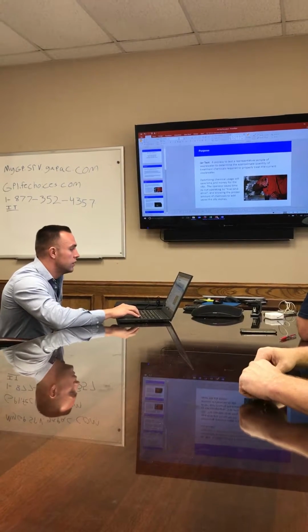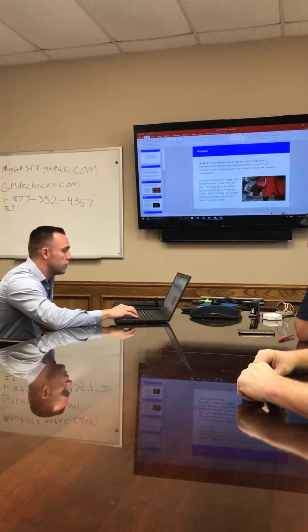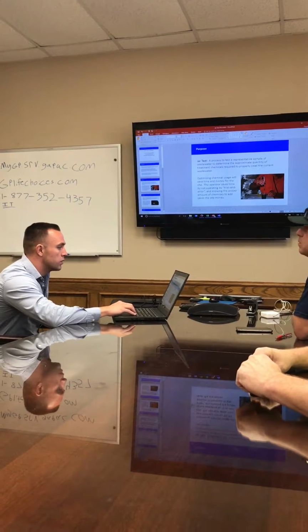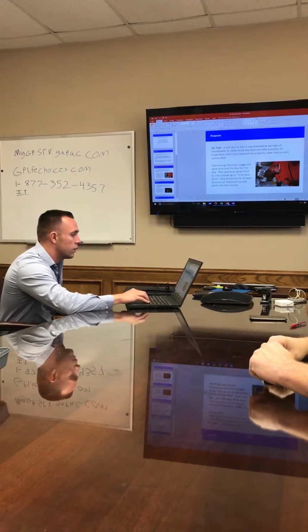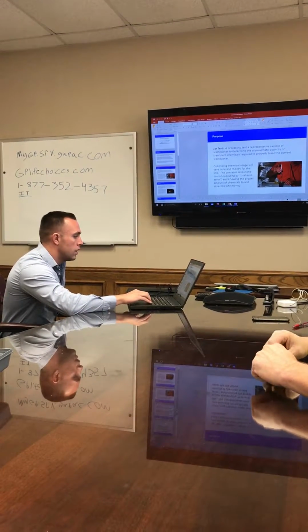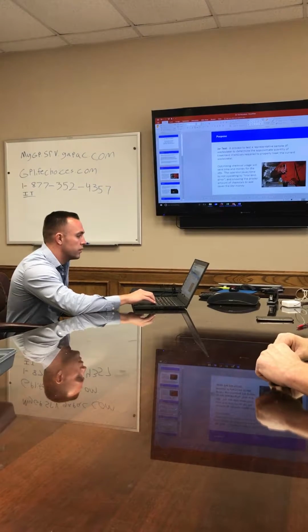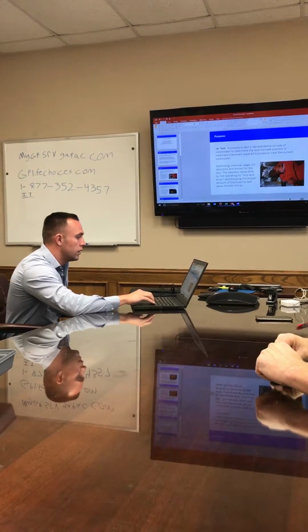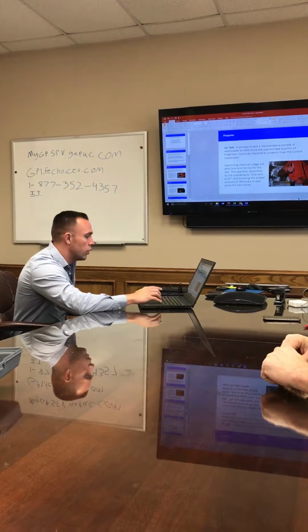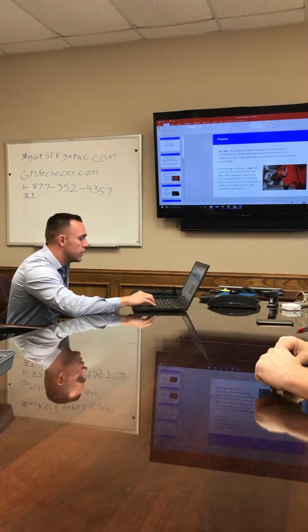The purpose. A jar test is a process to test a representative sample of wastewater to determine the approximate quantity of treatment chemicals required to properly treat the current wastewater. Optimizing chemical usage will save time and money for the site. The operator saves time by not operating by trial and error, and knowing the proper amount of chemicals to add saves the site money.